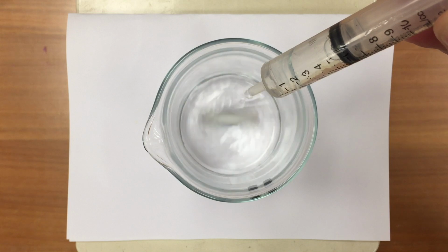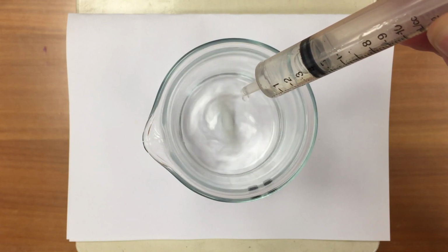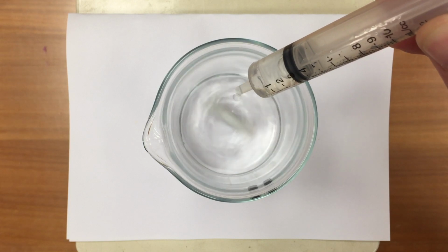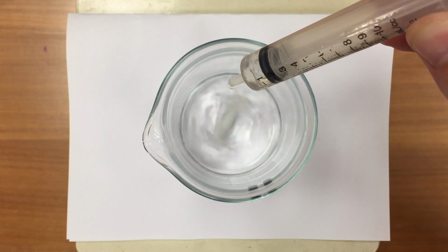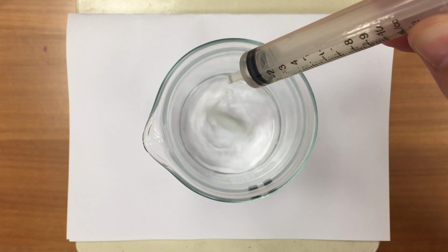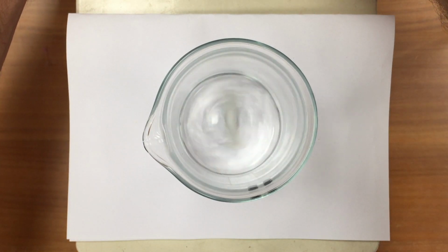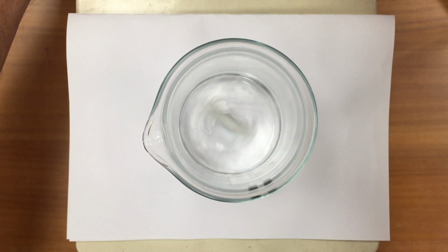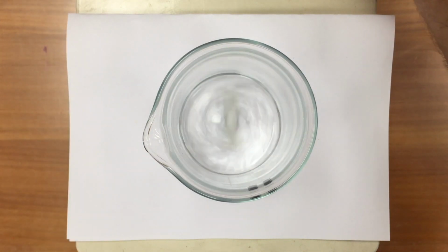Now just while we're waiting for the colour change, normally we would use a process called titration for this, using very precise glassware and very precise technique. I'll teach you that when you come back to school, and for the purposes of this video, this will be sufficient to teach the chemistry. So that was 10 mils in there, still no change, so I still haven't neutralised all of the acid. So I'm going to add some more.